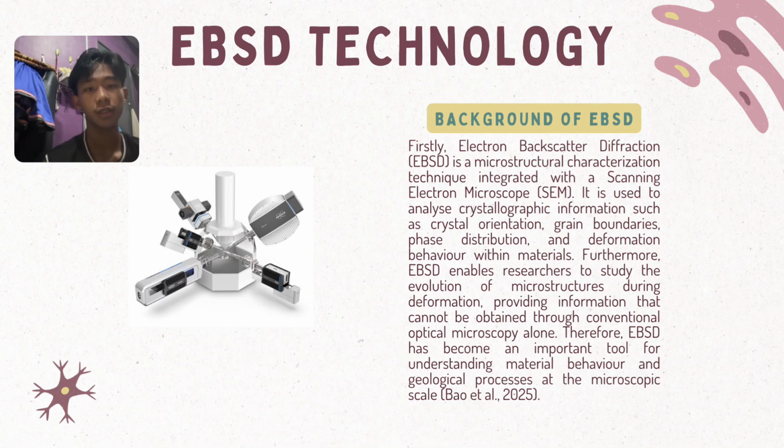Ultimately, EBSD enables researchers to study how microstructure evolves during deformation, giving us data that a conventional optical microscope simply cannot capture.